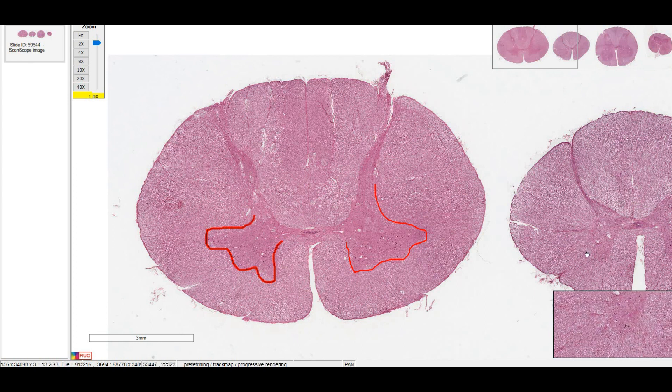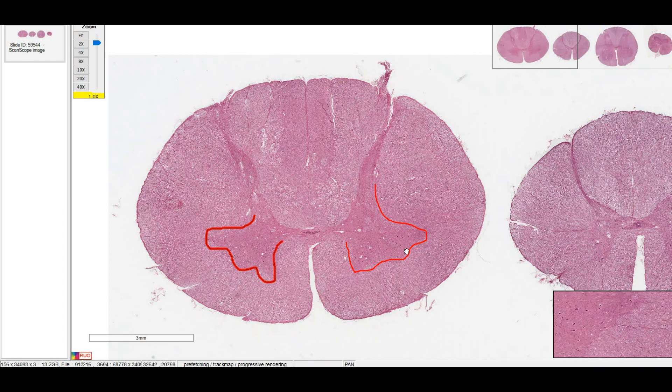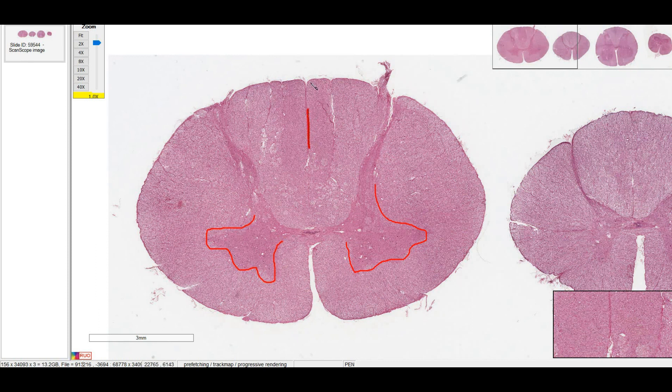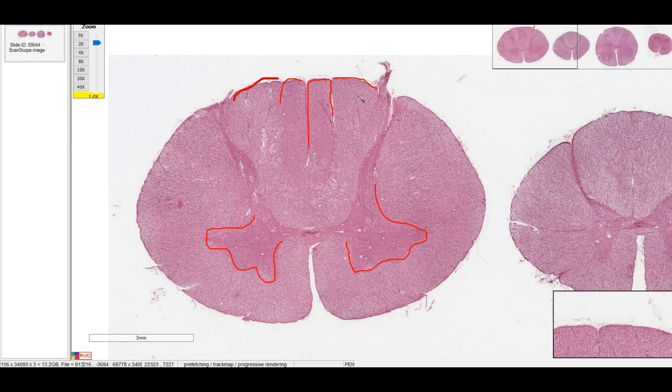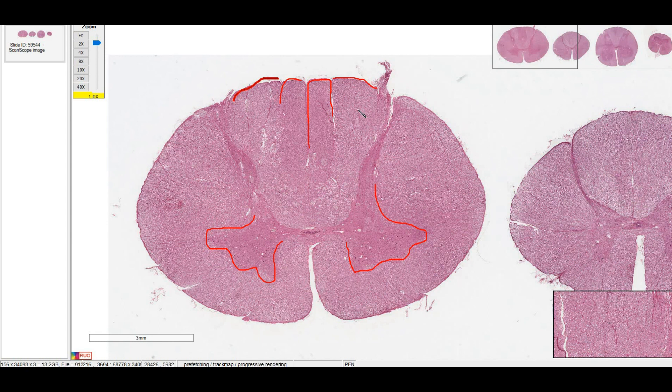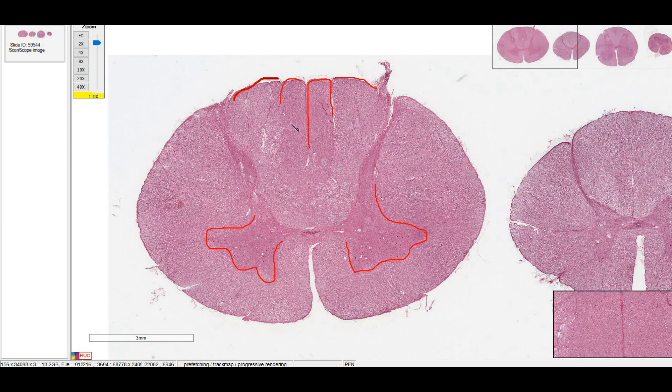If you compare it to the thoracic one, for example, this one doesn't extend out that far. But here you can see it goes pretty far laterally. Another thing to tip you off is if you see fasciculus gracilis here, as well as fasciculus cuneatus. Remember that gracilis gets sensory information from the legs, and cuneatus gets sensory information from the arms. And the way I remember that is if you think about the way that your whole body is structured, the arms are farther out compared to where your legs are.